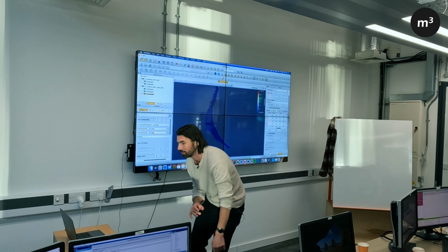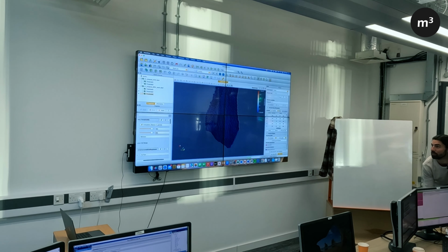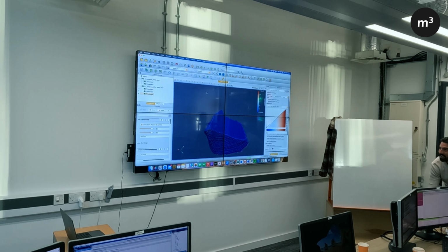It should fill in the rest of the grain, which are all the other face labels with a 164 on the other side. And sadly, because I didn't do any smoothing, it looks identical. But yeah, that's how you would visualize a grain on the surface mesh. But hopefully if you've done some smoothing, it will look much nicer.